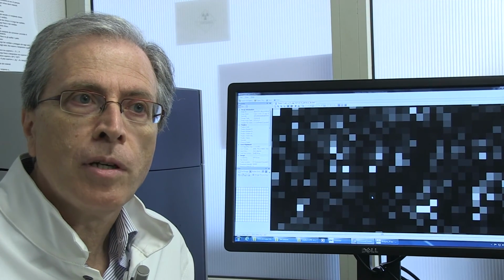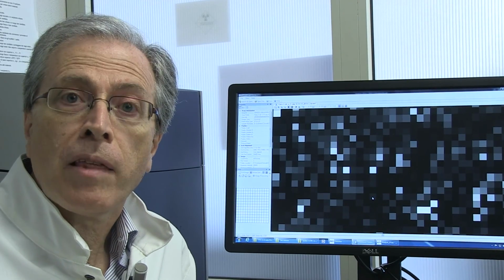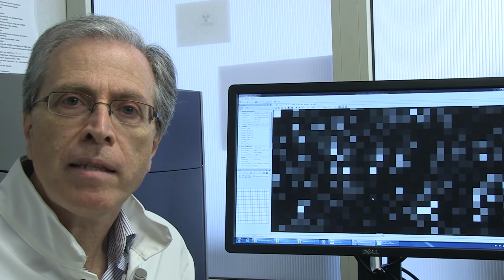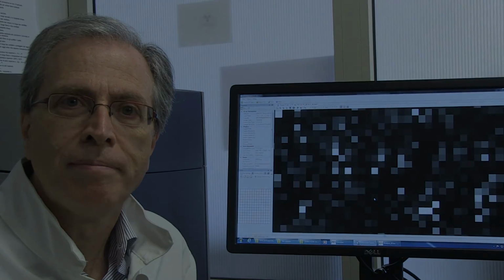Another dedicated software will combine all the values of probe cells corresponding to a single transcript to provide 60,000 transcript values. The 60,000 transcript values represent the so-called gene expression profile per sample.